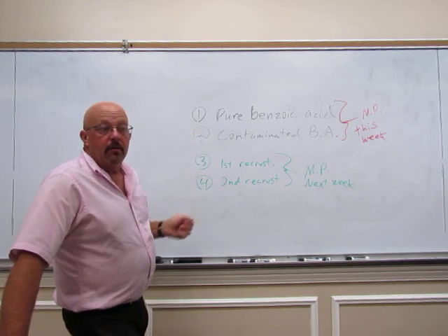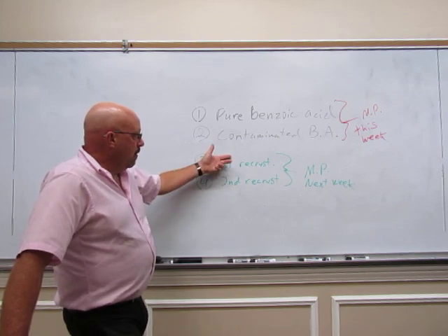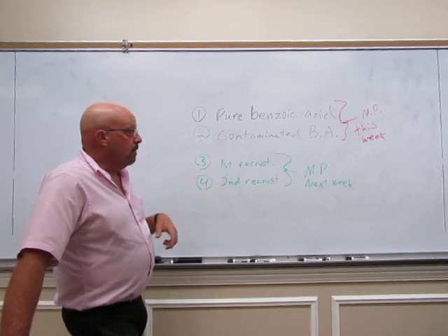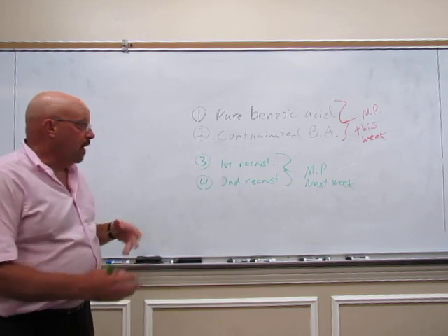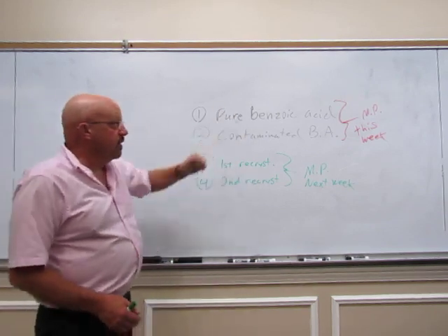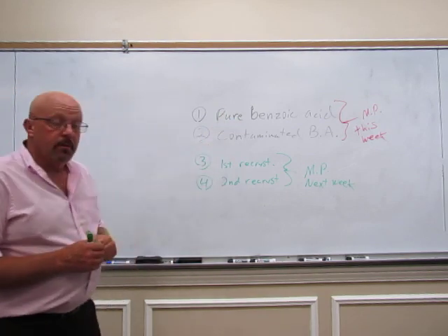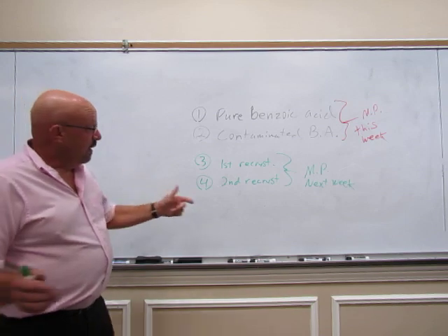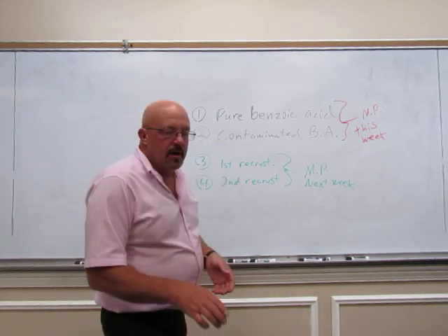Might be, might not. Discuss that in your conclusions. Talk about if 2 was good enough. Maybe we should have done 3. We're only going to do 2, but just talk about it. You've got the numbers there to compare with. So if this one matches the pure one, then 2 was enough. If they don't match, then we probably should have done more. So discuss that in your conclusions.